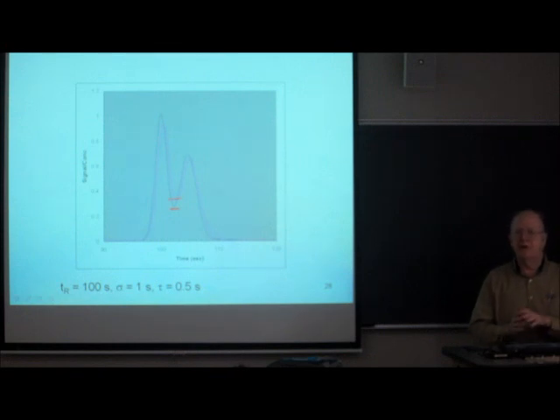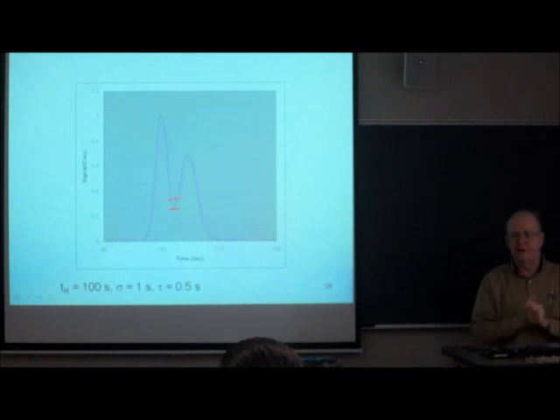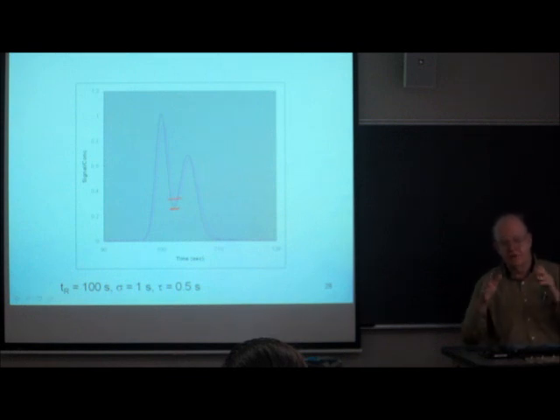The same sort of thing would happen with injection volume. If you had two peaks that were close together and you inject too much volume, you can diminish the resolution, the valley between the two peaks that are separated. You want to increase the volume to get more signal, but if you increase it too far you screw up the resolution.